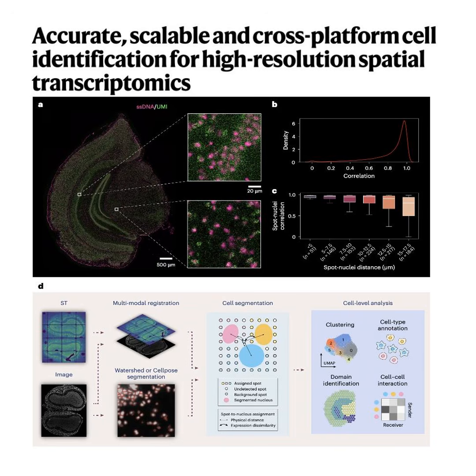Yep. So, for you listening, if we can now computationally identify the exact cells acting as bouncers, keeping the immune system out, how might that completely change the way we design future cancer drugs? It transitions the whole field from just observation to targeted mechanism, but we do have to impartially review the limitations here. Cellist is powerful, but it has boundaries.